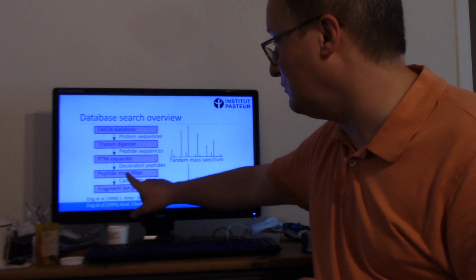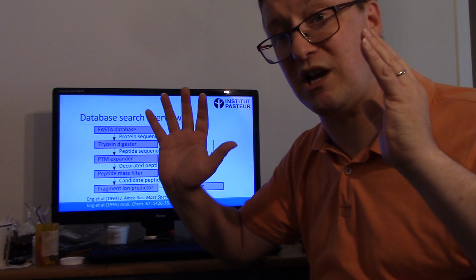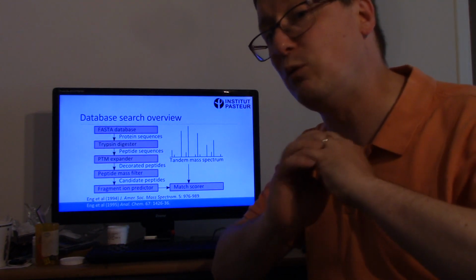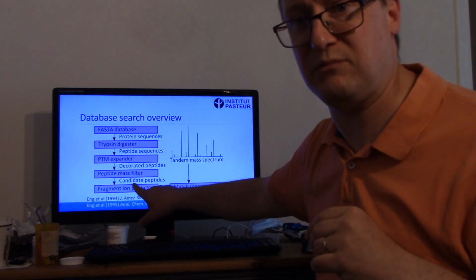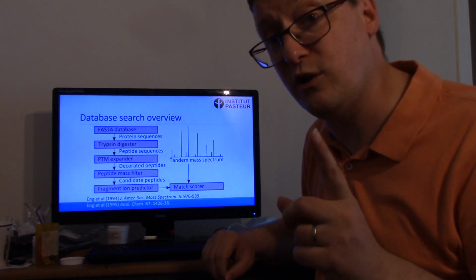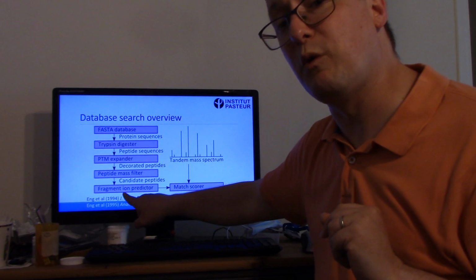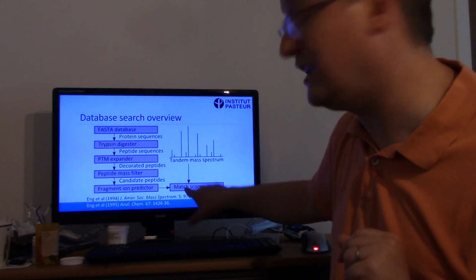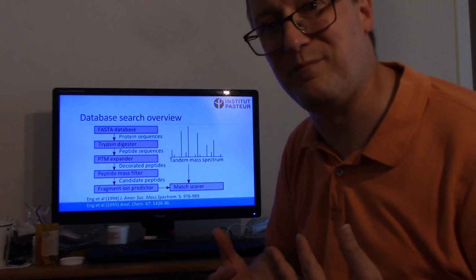So we are going to curate down this big list of decorated peptides to just those that match the precursor mass very, very well, perhaps within 20 parts per million. Those will be the candidate peptides that we compare to our tandem mass spectrum. For each of those, and only for those that meet the peptide mass filter criterion, we will predict the fragment ions that should result and compare them in a match scorer to the tandem mass spectrum.